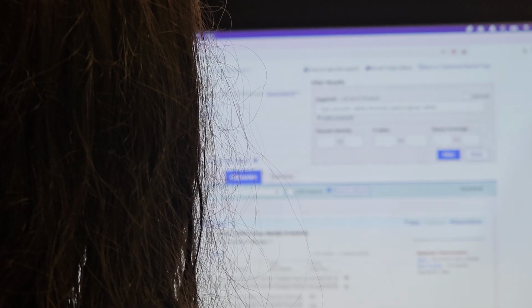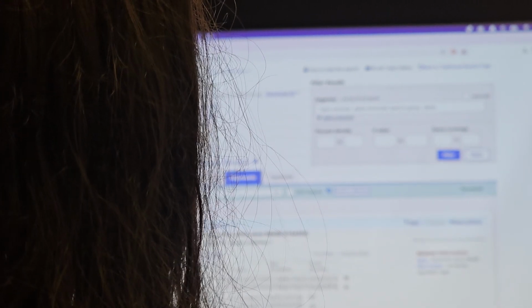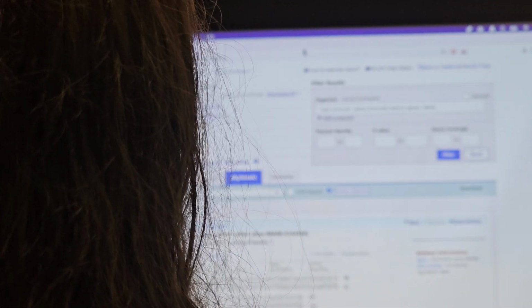Yes? What we did have a lot of was around that 78 region, so a lot of people probably have. Yeah. So I'm going to show that next. If you go back to your trace, look at around nucleotide 80 to 90 in this region here.